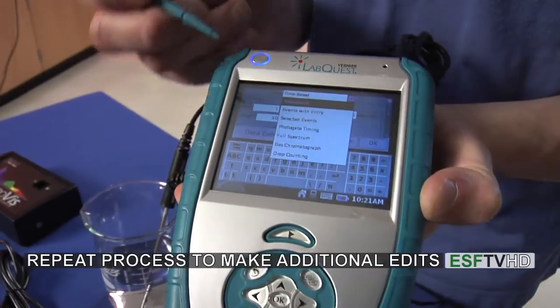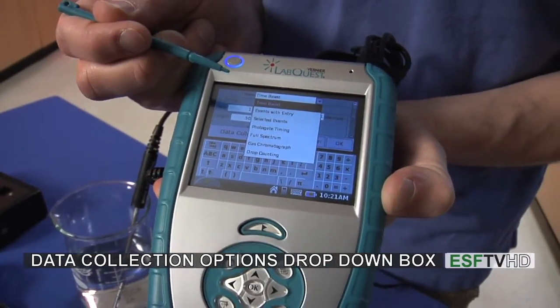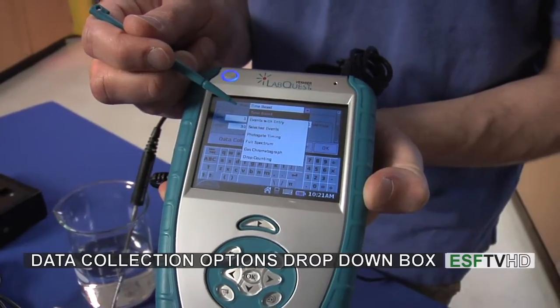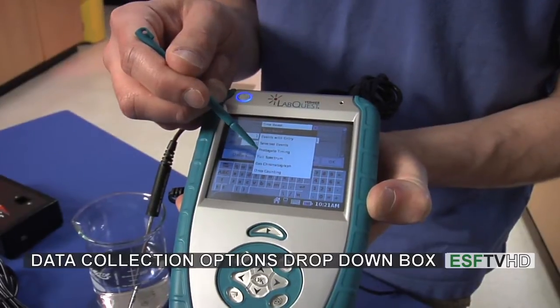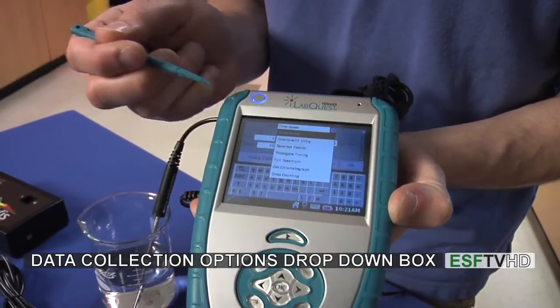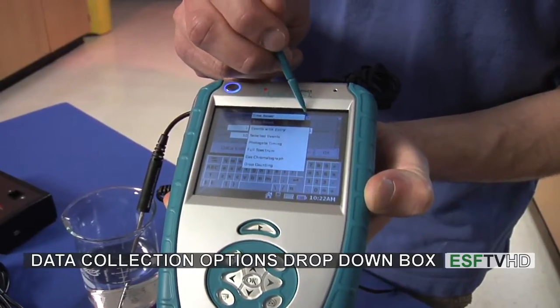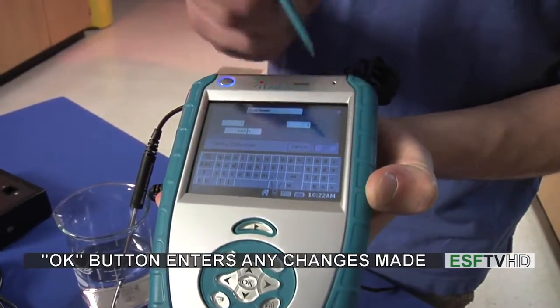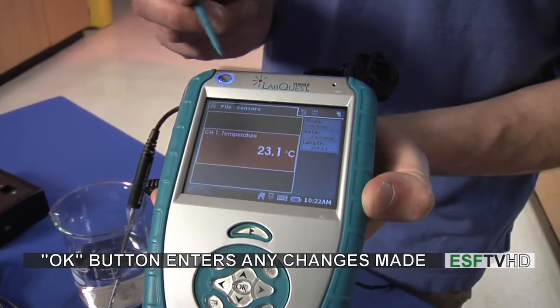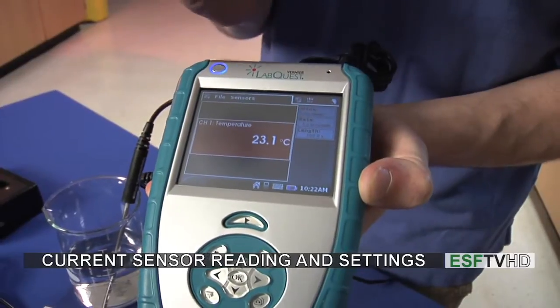We also have a few different options for how we want to collect data. We could collect them as selected events, which means we will keep data when we want it to — if we're ready to collect a point at a certain time we just hit okay. We also have some options involving the spectrometer which is full spectrum. In this case we're going to use the time based experiment, so I'm going to close that drop down menu, hit okay, and it's going to go back to the screen showing one sample per second at 500 seconds.